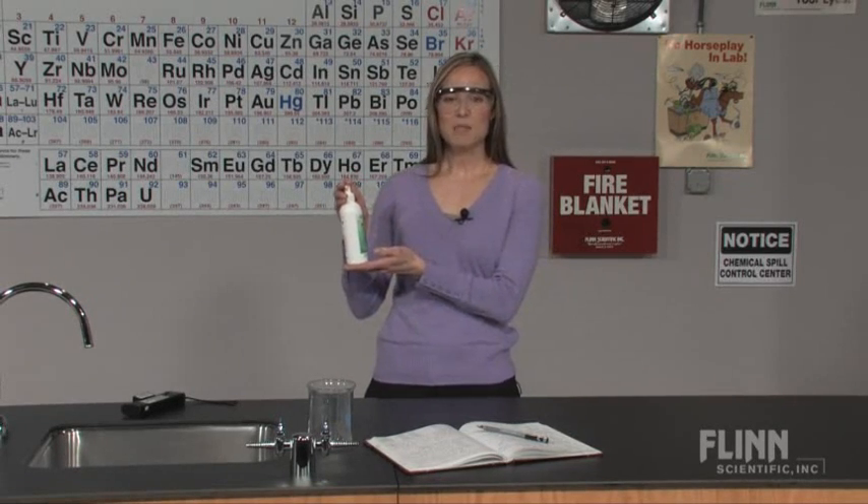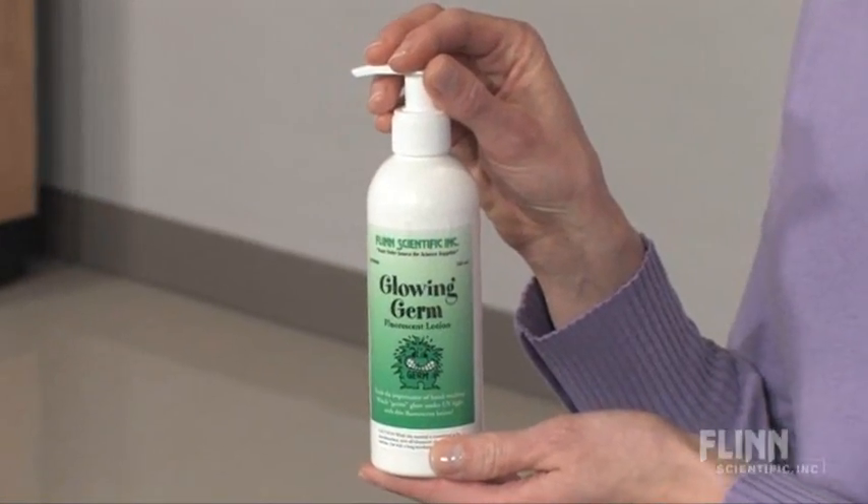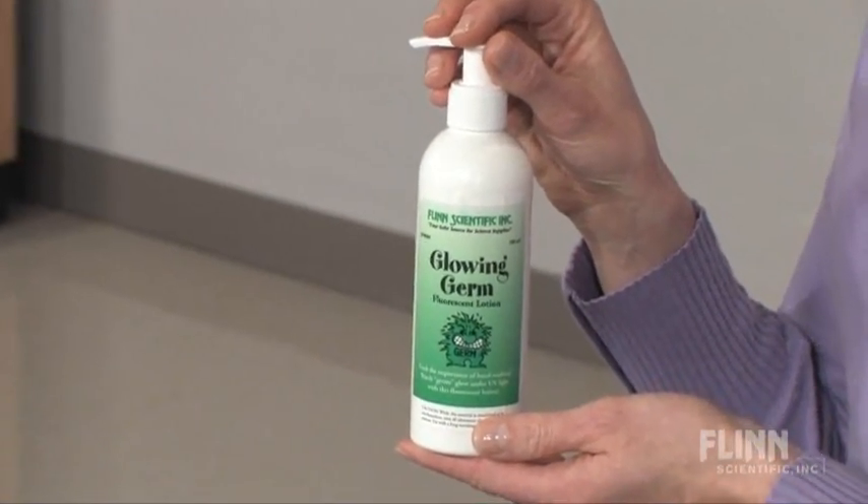The Glowing Germ Lotion comes in a convenient pump bottle and is formulated with mild cosmetic ingredients and a fluorescent dye, so it glows under UV light.